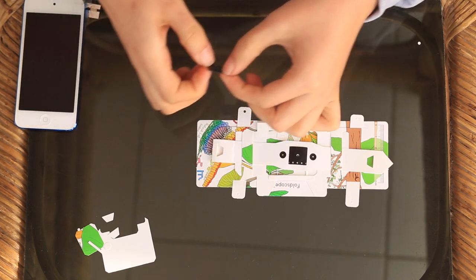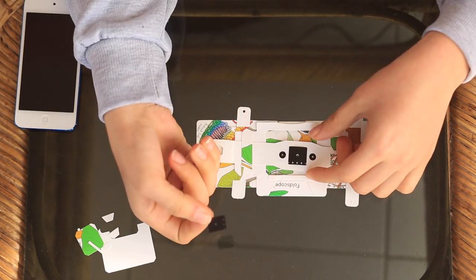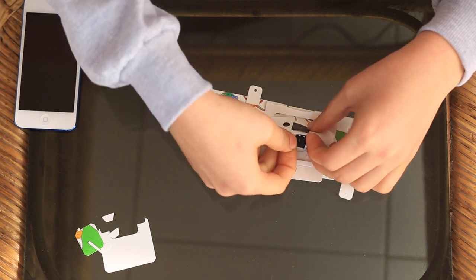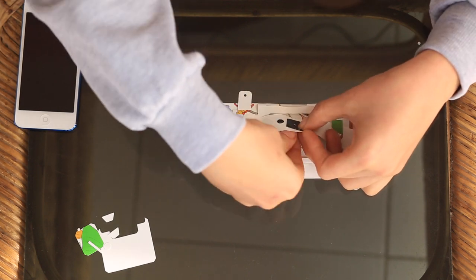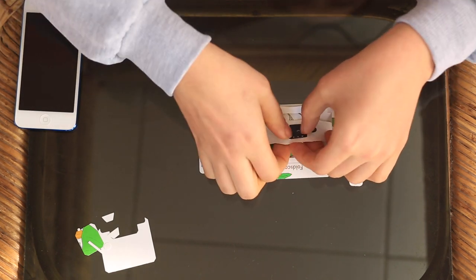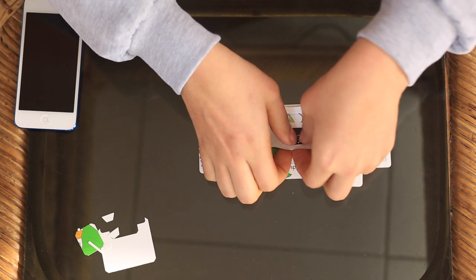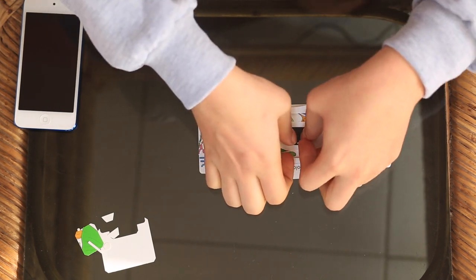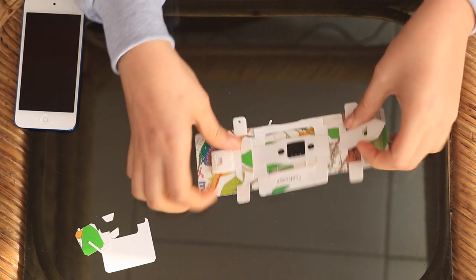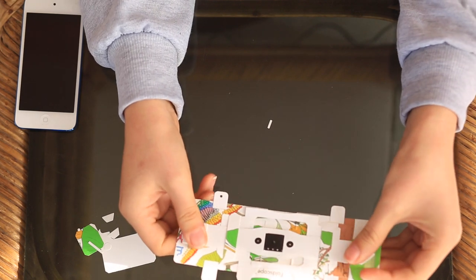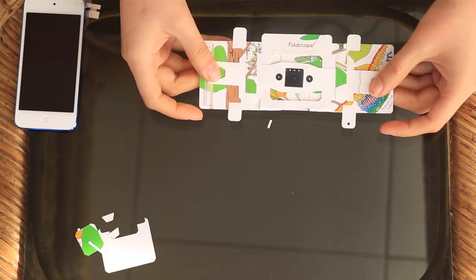The last thing that locks it into place is the lens. So you take the lens, you put it underneath like this so it matches up with that hole and then you press it into place. And there you have a fully working Foldscope with the lens.